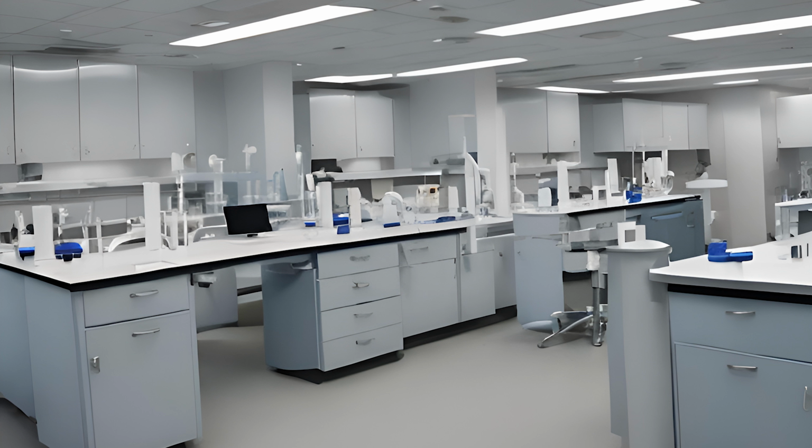Don't apply cosmetics in the lab. That includes chapstick, lip balm, lotions, things like that. You don't want to touch your face when you're in the lab. You're not going to take your lab PPE outside of the lab because hypothetically, it could be contaminated. Even if you've been very careful all day long, you cannot prove that your PPE is not contaminated, so you do not wear it outside the lab.